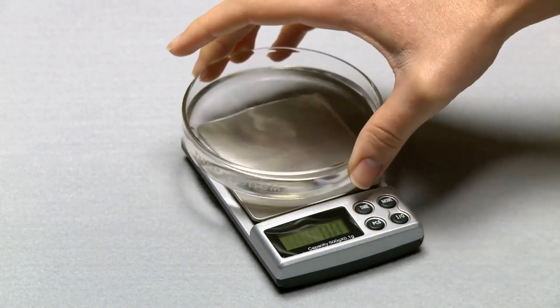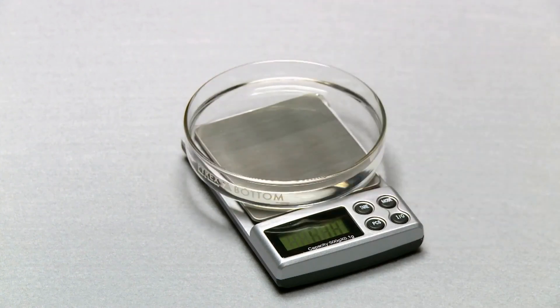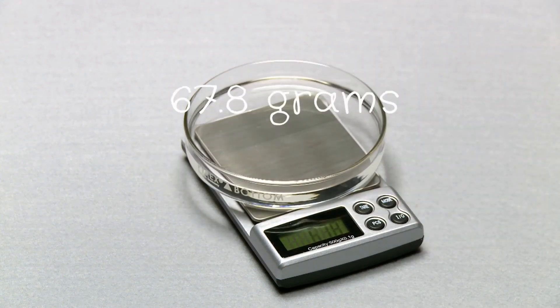First, we add ethanol to the petri dish and put it on the digital scale. We're starting with 67.8 grams of ethanol.